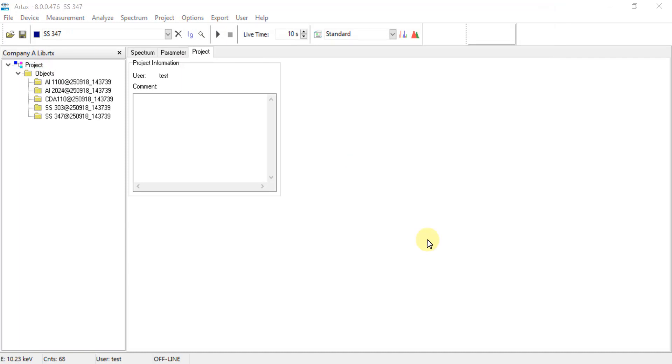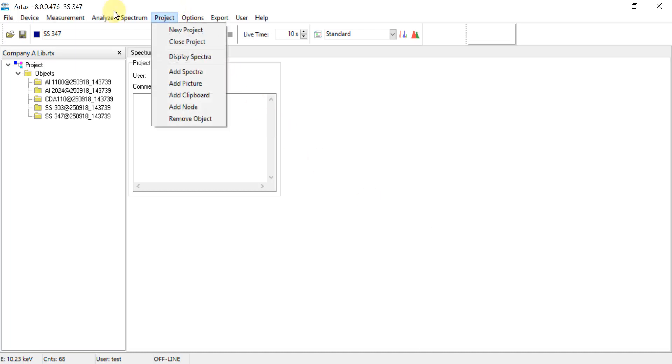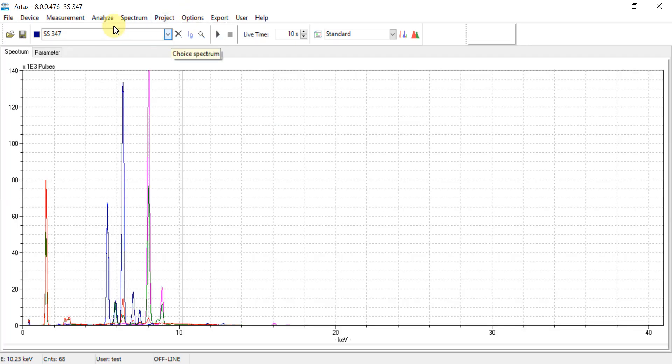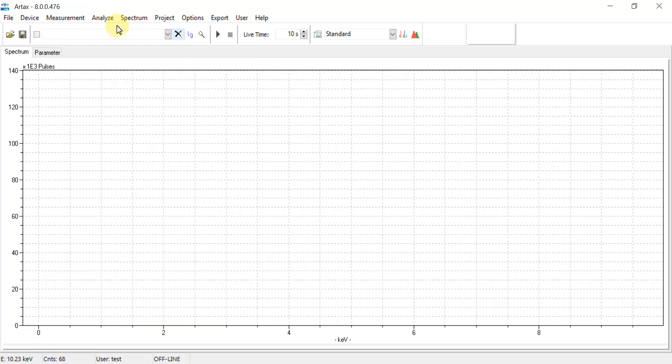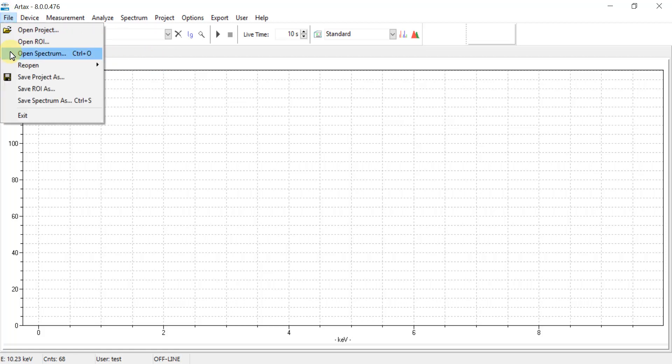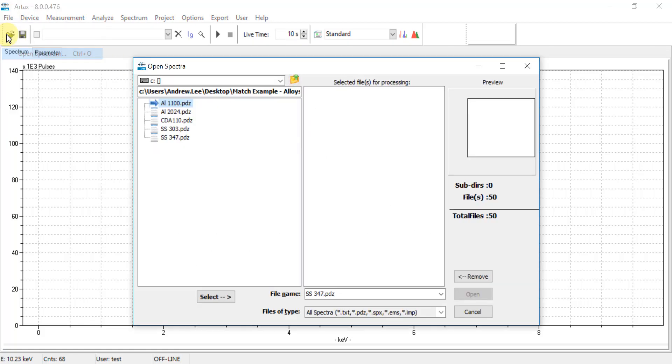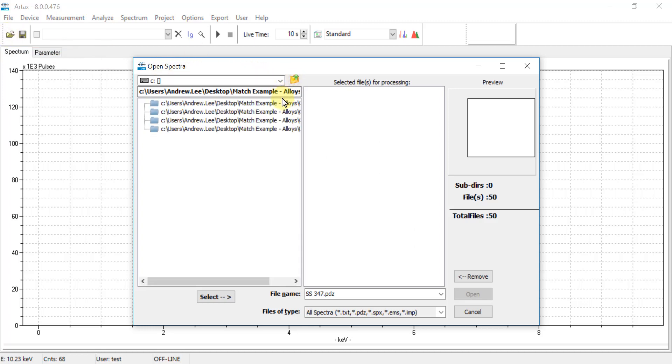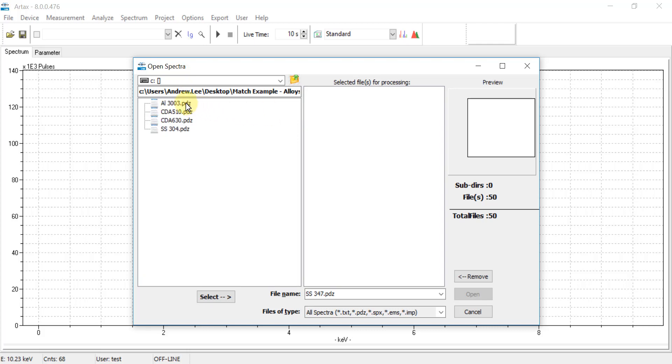This procedure will now be repeated for company B and C. So first close out this project by going to the top Project menu and then select Close Project. Then in the spectrum viewer window, select the Close All Spectra icon to clear out all prior PDZs. Then go to File and Open Spectrum and navigate to the second group of PDZ files, which in this case is for company B. Highlight those relevant files, and then again hit Select and then click Open.